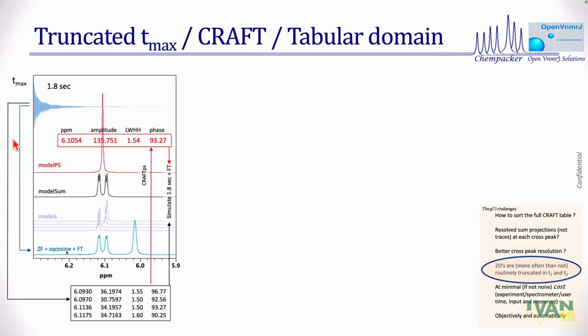That is an example I want to use to evaluate how low can I go in my T1 max and T2 max without giving up resolution. That's fundamental, because my challenge is to get good resolution so that I can do a good projection. So I just want to understand this. How low can I go?